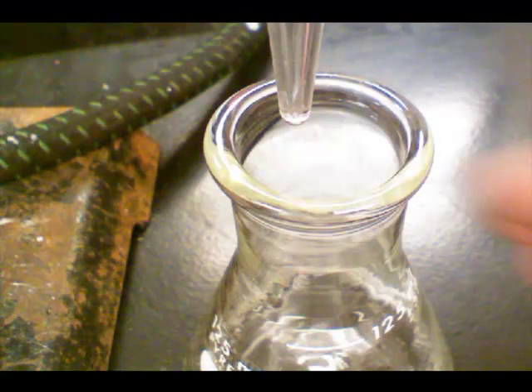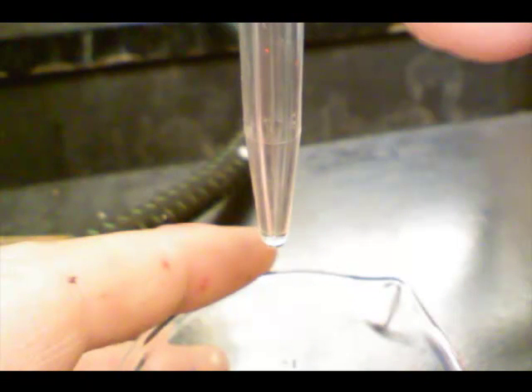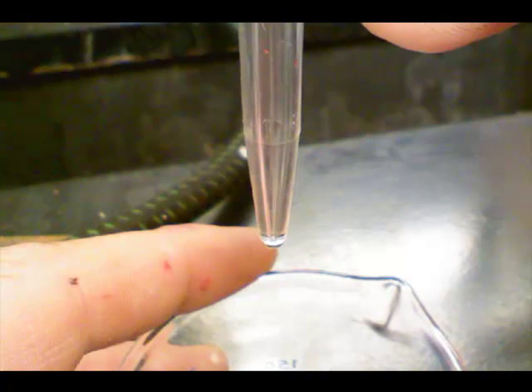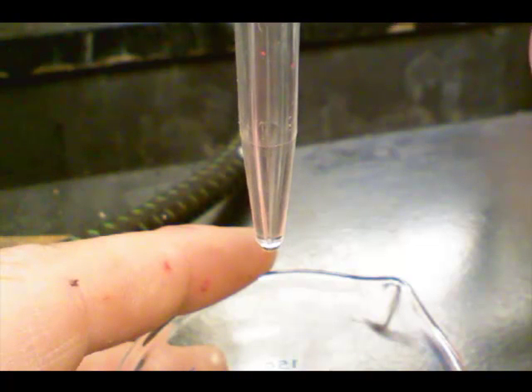Now, to prepare for this titration, there are a few things that I've got to get ready with. One is, at the business end of this thing, where the valve is, there's air in the tip, and everything that comes out of there gets measured. I don't want to measure air. I want to measure only the acid that I'm dropping out of here. So I'm going to open the stopcock and allow just enough flow to make sure that the tip is completely filled with liquid, and then I'll stop it.